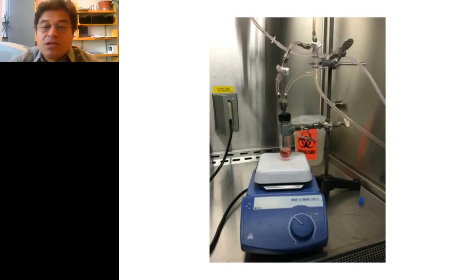Just a little bit more of a close up. This is the sample delivery area, and in this area, again in a hood, we have a magnetic stirrer, and we put a little stir bar into this apparatus. The cells are being introduced via this three-way syringe loaded typically with 10 mLs of material, at concentrations of 10^7, 10^8, or 10^6 cells.